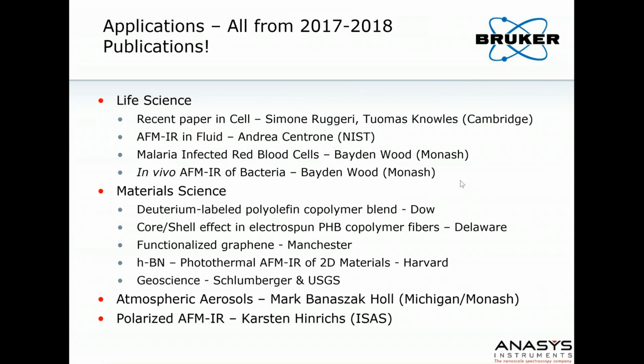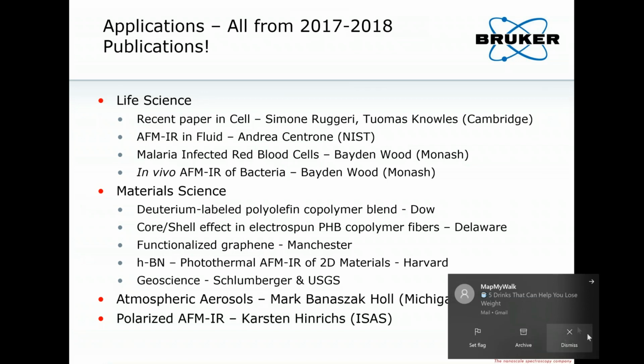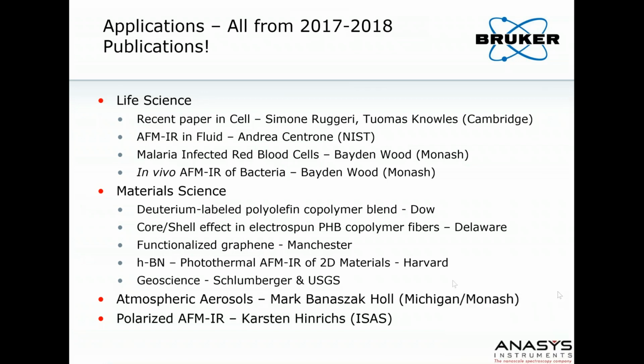But our users are really now starting to generate some very nice work using the AFM-IR technique. And so I'm going to go through 4 of them in the life science area and 4 of them in the material science area, and then I'll end with a paper on atmospheric aerosols and polarized AFM-IR.